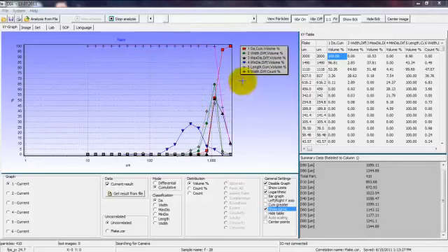And the width in curve number 6 as a differential count percent or number distribution. And you can plot any of these curves using any of these combinations of choices shown below the graph.